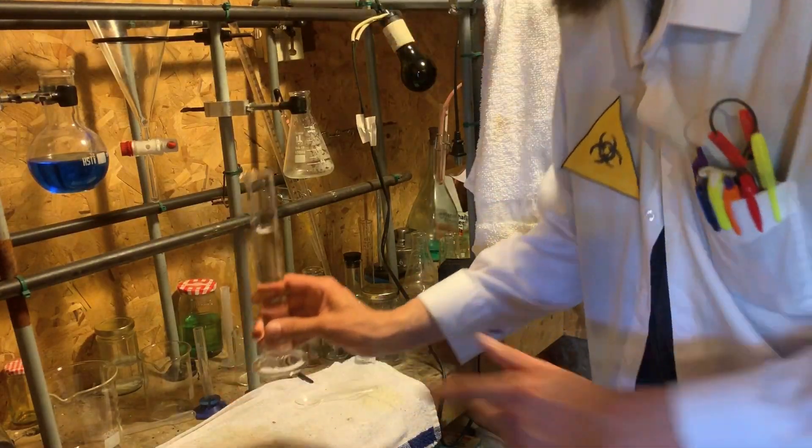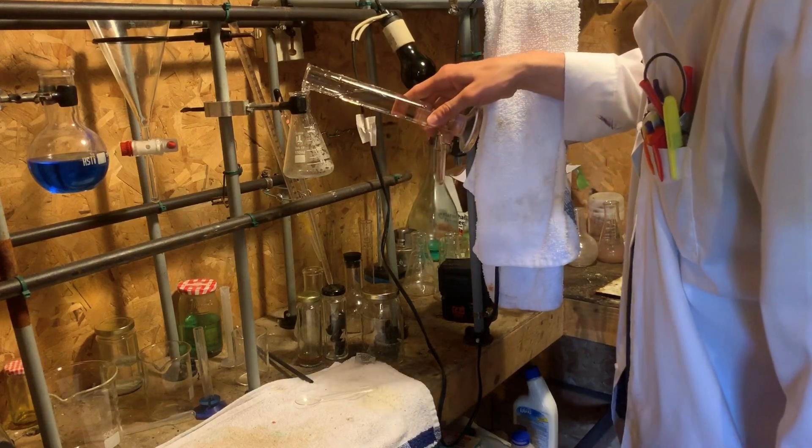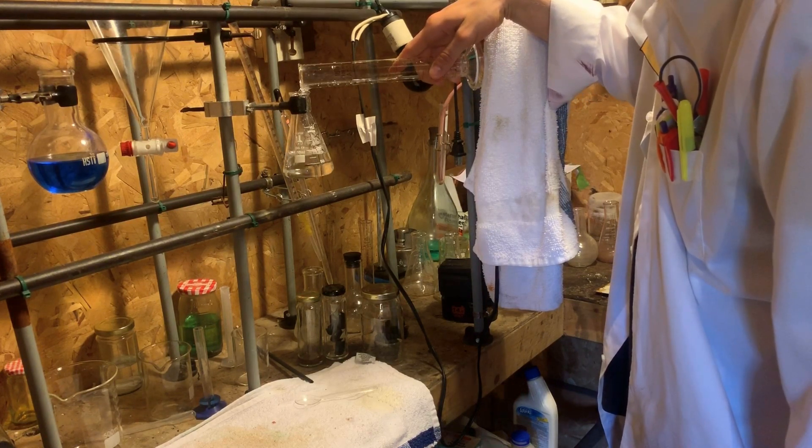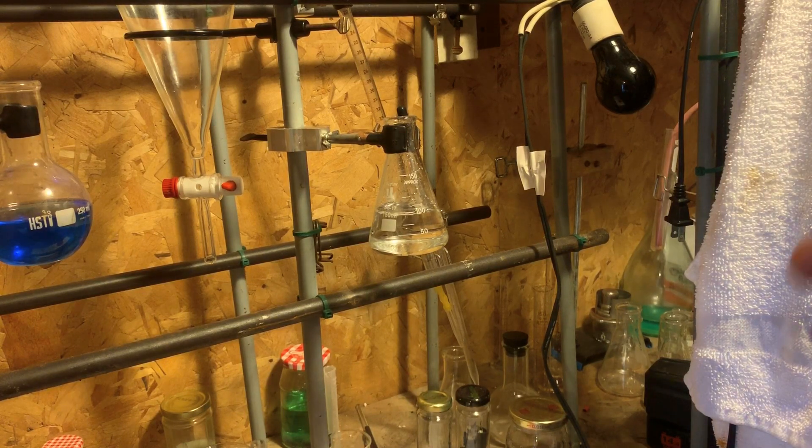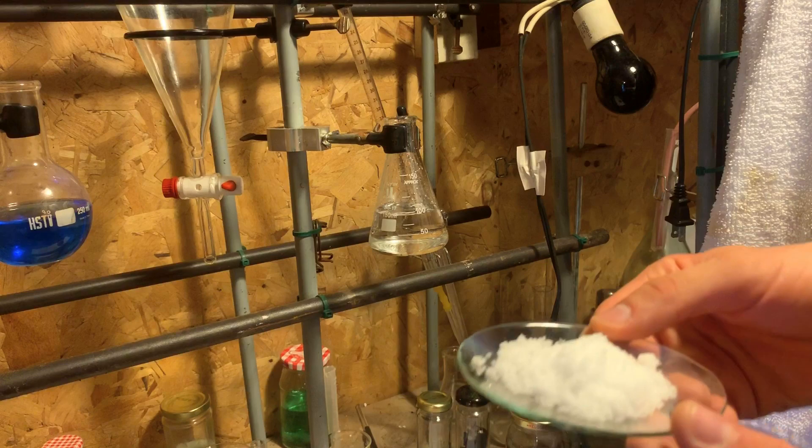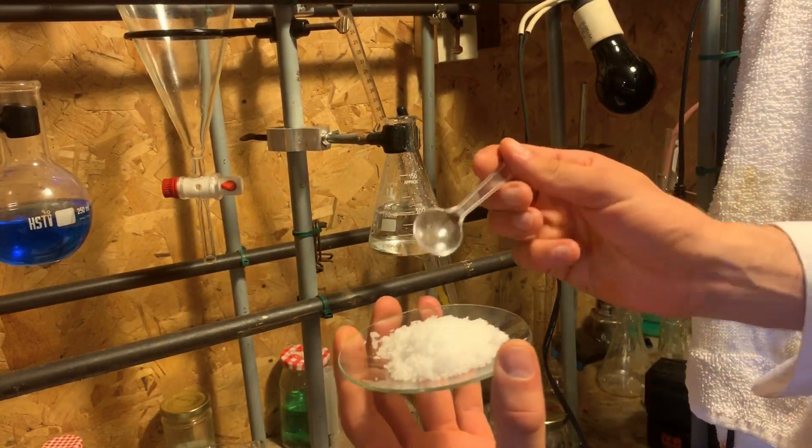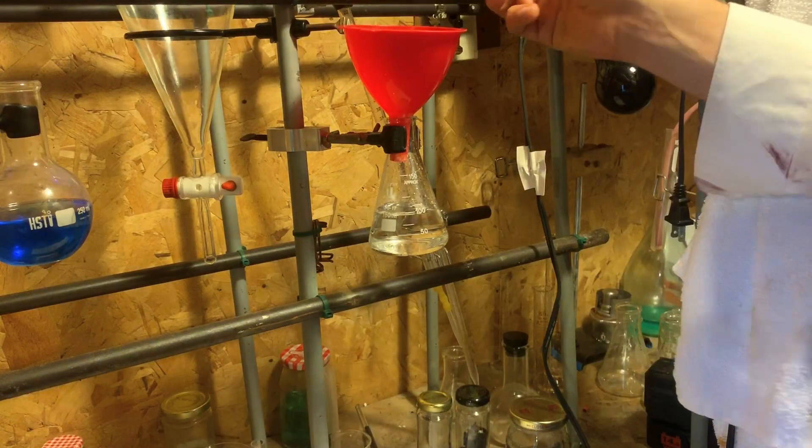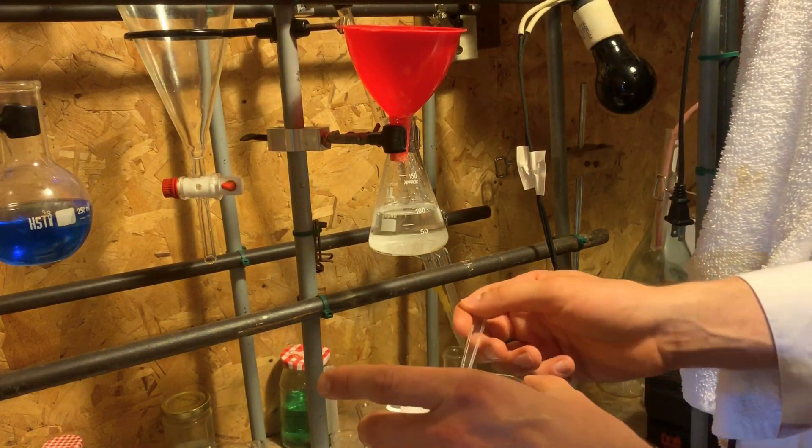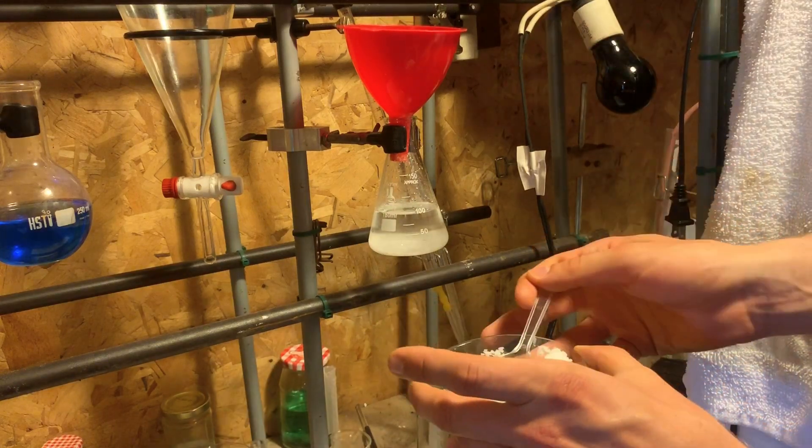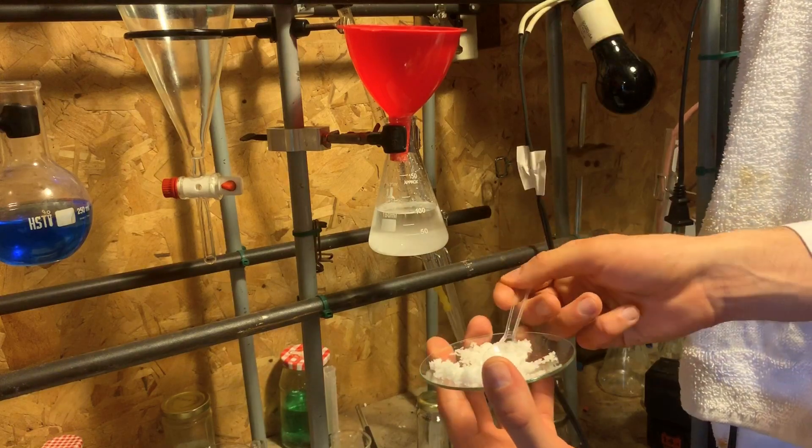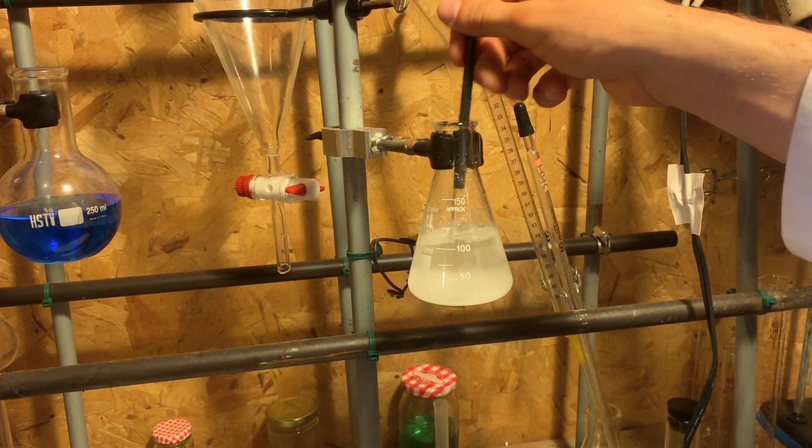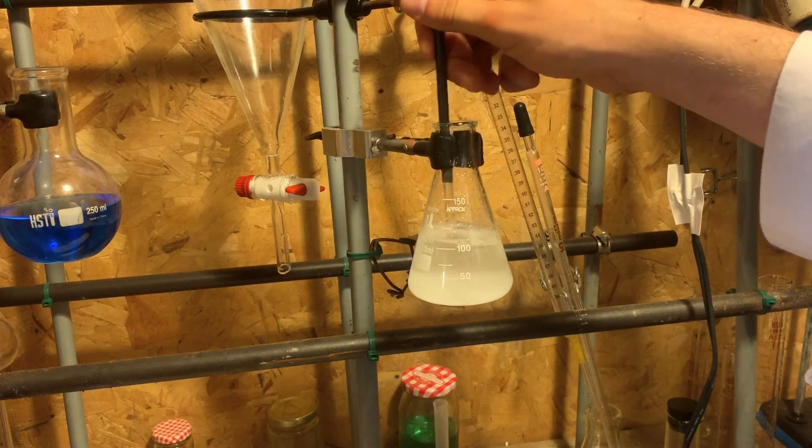I'm going to add 100 milliliters of water to this flask. So to create an aqueous solution of sodium bromide, I'm going to take our sodium bromide here and add it to the water. And we need seven grams of this. I'm now going to stir the solution around. This will help to dissolve the sodium bromide into the water.